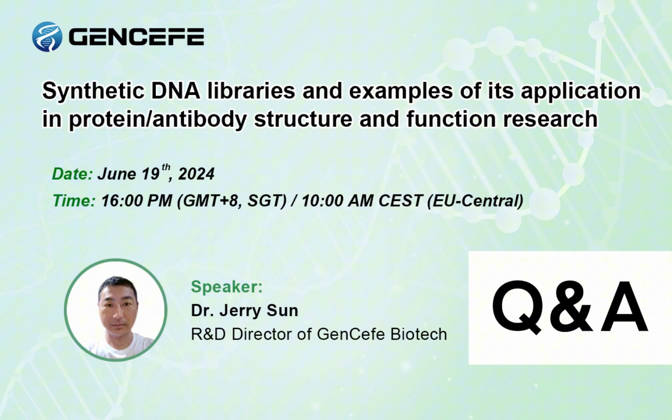For an antibody synthetic library, do you provide a naive library or a randomized library? Do you do the mutation in the CDR region or in the entire antibody variable region? Can you repeat the question, please? Do you provide a naive library, or any randomized library? Yes, a randomized library can be used in antibody modifications and immunizations.